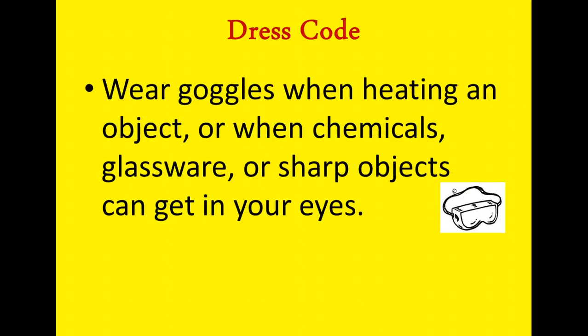First under dress code is that you need to wear goggles when heating an object or when chemicals, glassware, or sharp objects can get in your eyes. Now, I know that these goggles look silly, but when we're all wearing them, we all look silly, so we'll look unfashionable together. So please always wear them to protect your eyes and be safe.